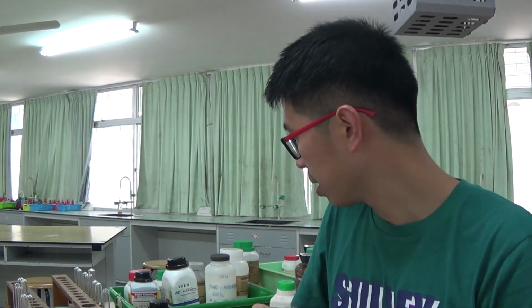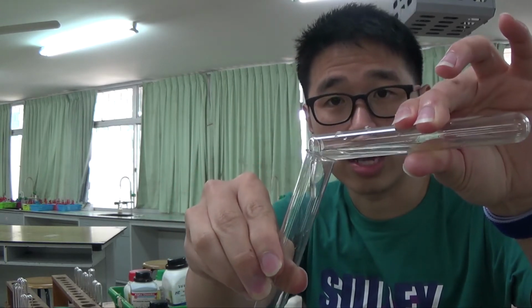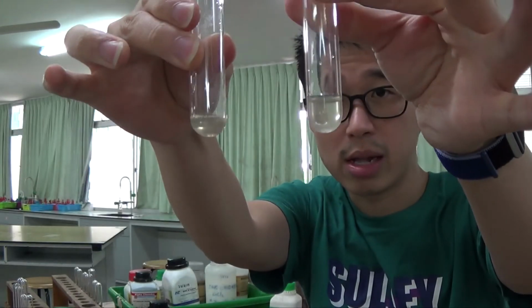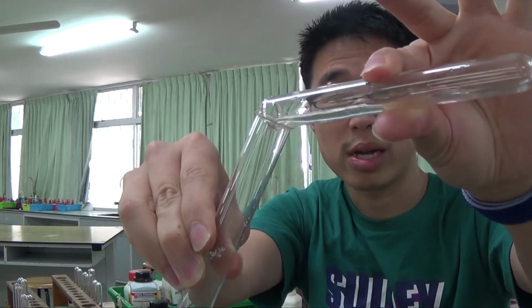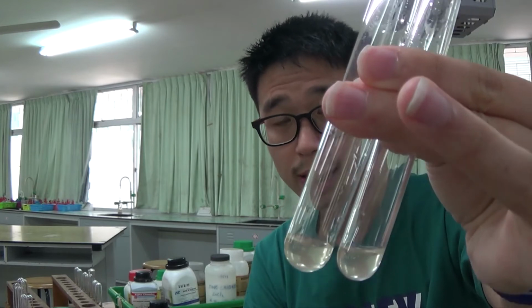Anyway, so what I'm going to do is separate it into two portions. One of which I'll test with ammonia, and the other one I'll test with sodium hydroxide. I'm not that interested in testing for the ammonium cation because I know it contains ammonium cation. I could just, after I add extra sodium hydroxide, warm it and I get a pungent gas that turns red litmus paper blue.